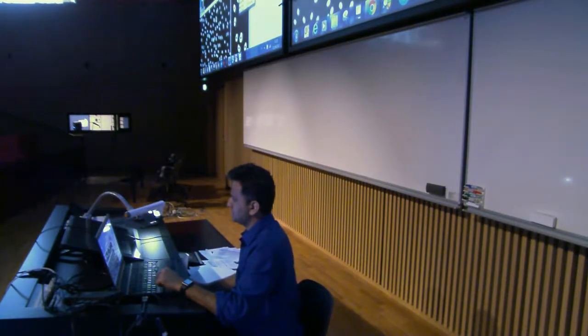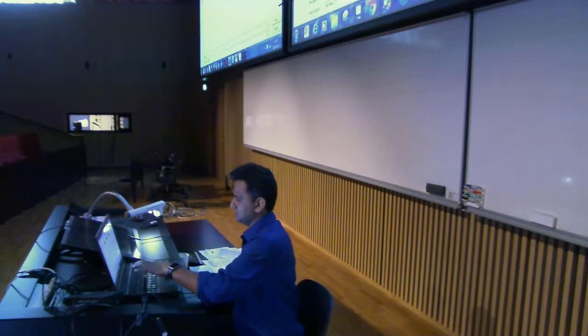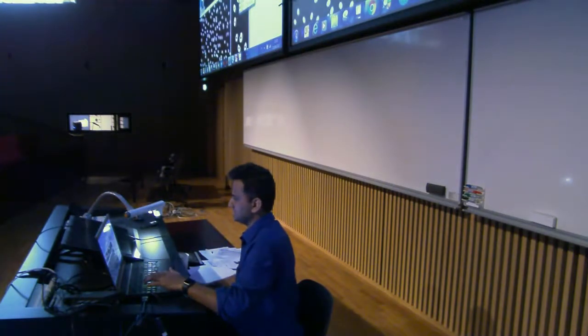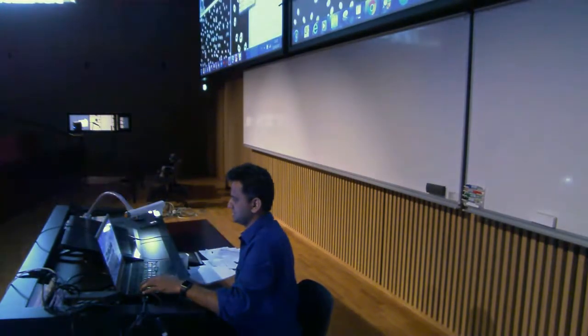That's possible. You can save this because that's important, right? So you just go to more, and then you can save this ROI. Just put it here. Is it all? I have just deselected. Oh, okay, because I have selected only this one. So let's say measure, deselect everything. Okay, and then you just go more, save, ROI set. Everything will be, this is ROI set now.